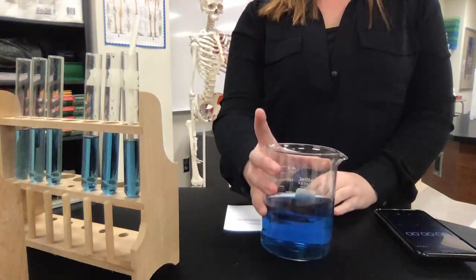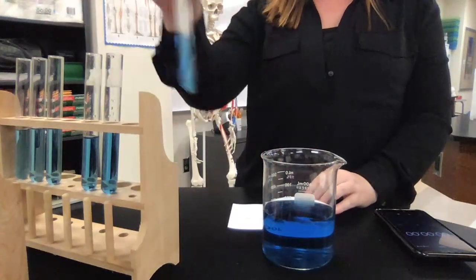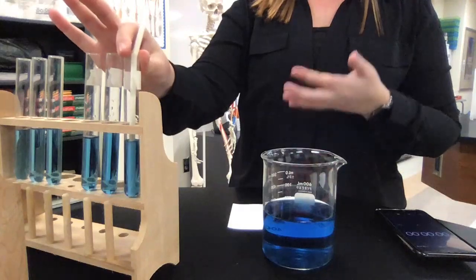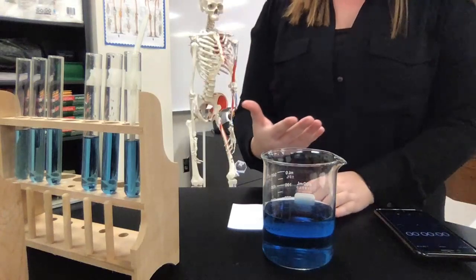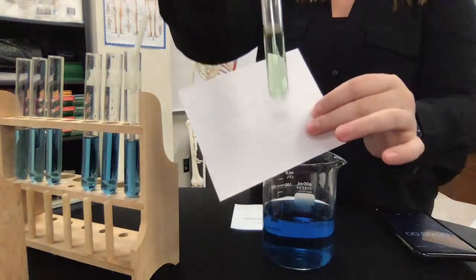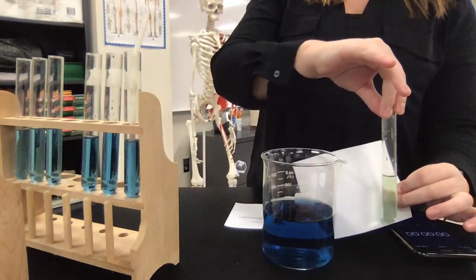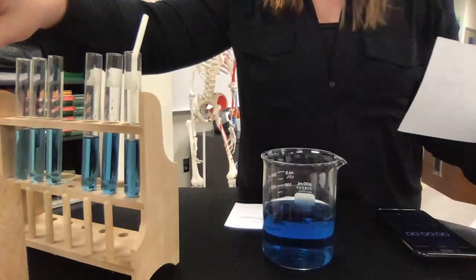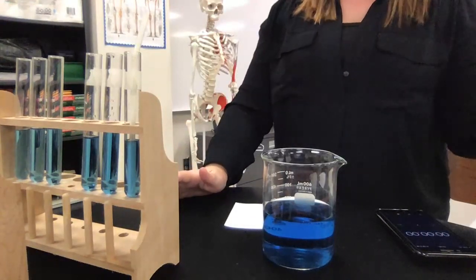Bromothymol Blue is a pH indicator. When you are breathing, you're releasing carbon dioxide, and as you're blowing bubbles through the straw into our solution, you're releasing that carbon dioxide into the solution. When carbon dioxide meets up with water, it creates carbonic acid, which is a weak acid. Since Bromothymol Blue is a pH indicator, as it's being exposed to that acid, it's going to experience a color change — to more of a yellowy-green color. So you can see the color differences here: one is different than the other. This one had the carbonic acid in it, which is why it changed color. That's how Bromothymol Blue works — as you're breathing, you're releasing carbon dioxide, and that causes the color change.